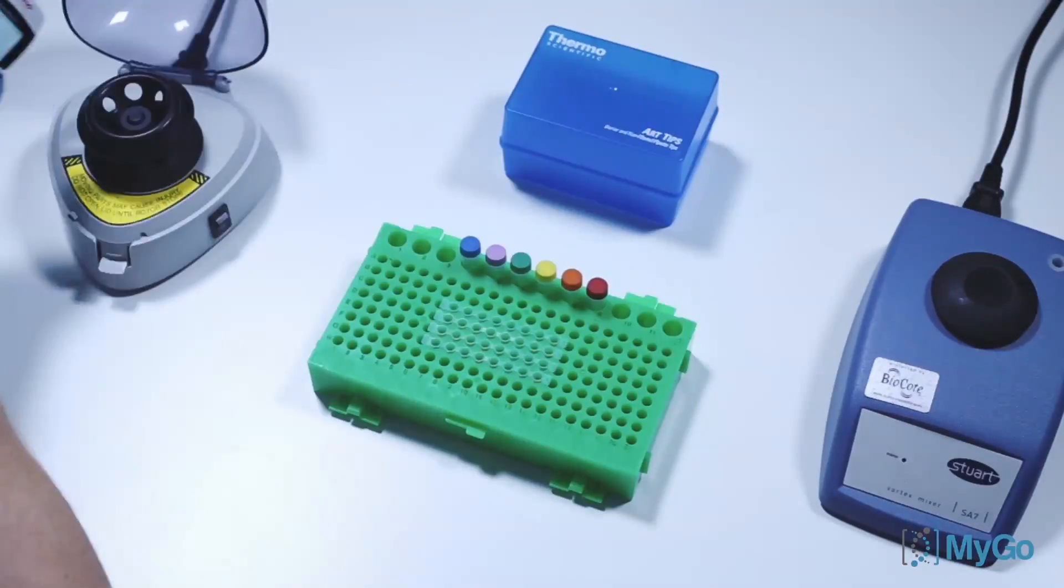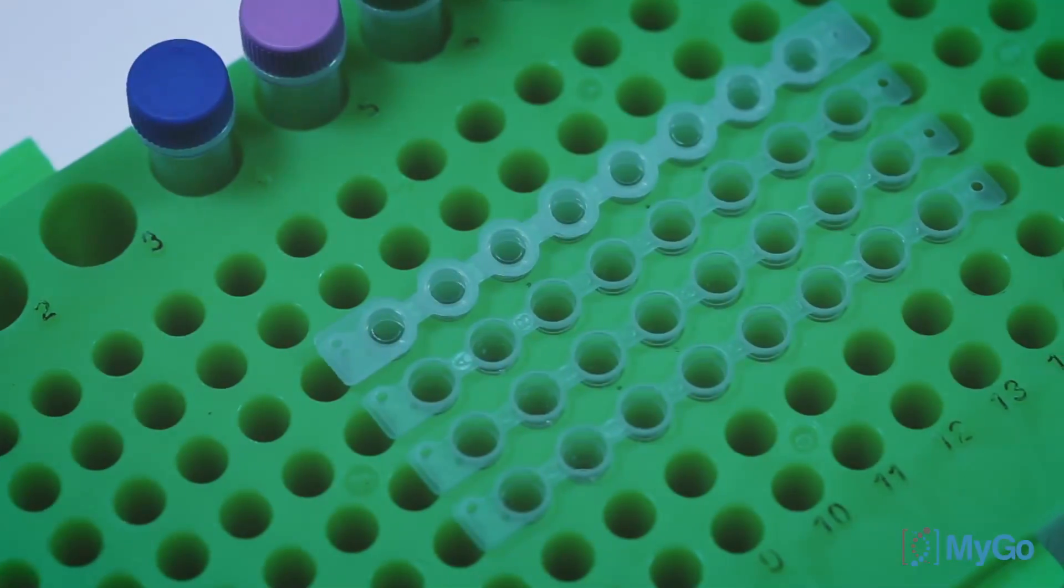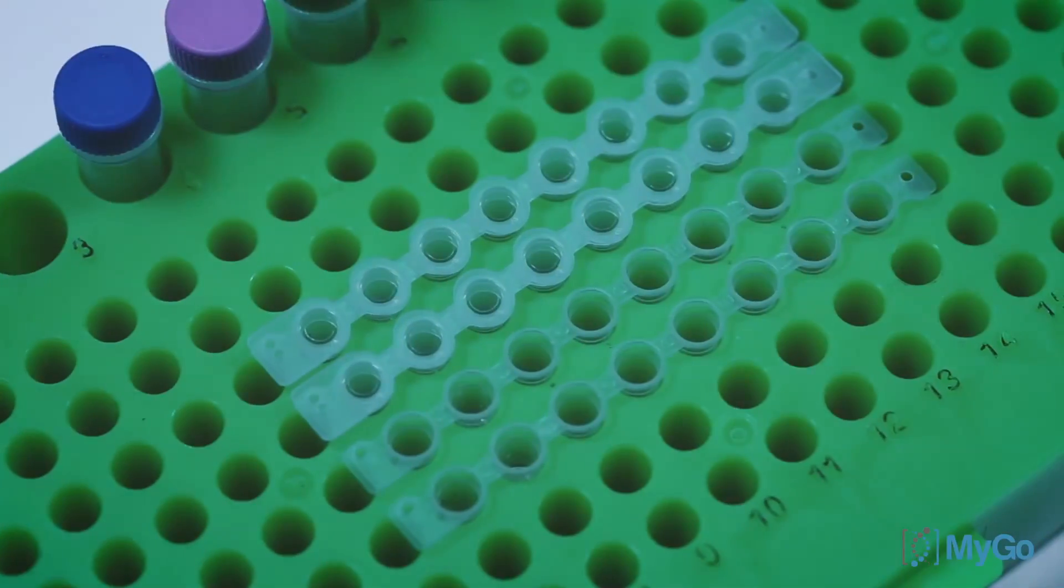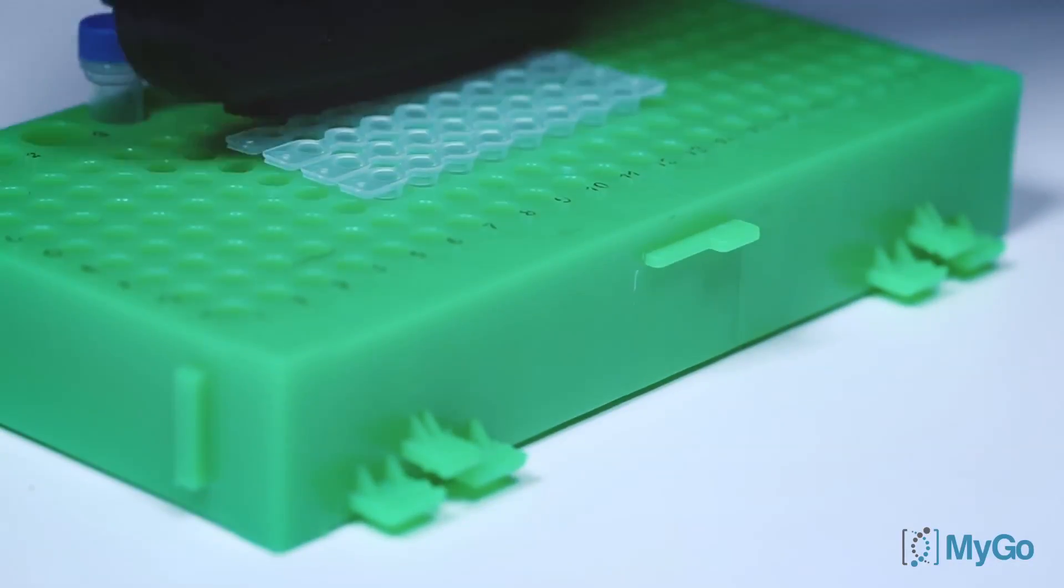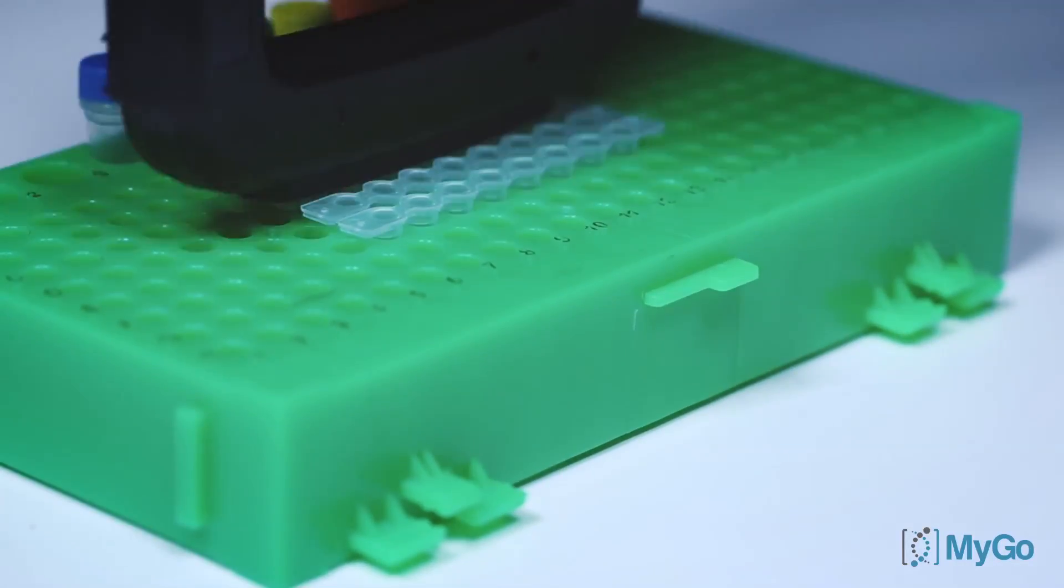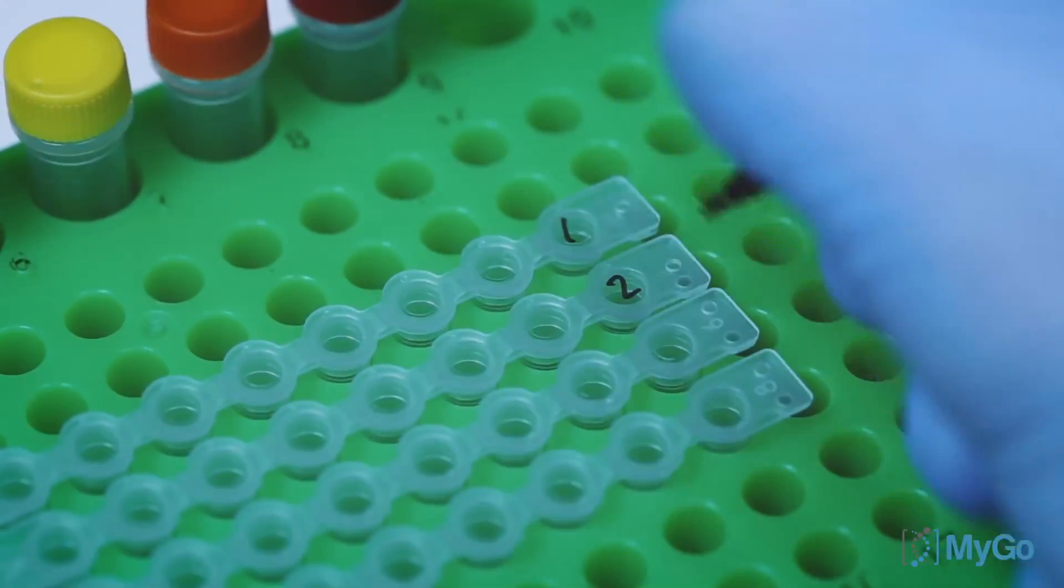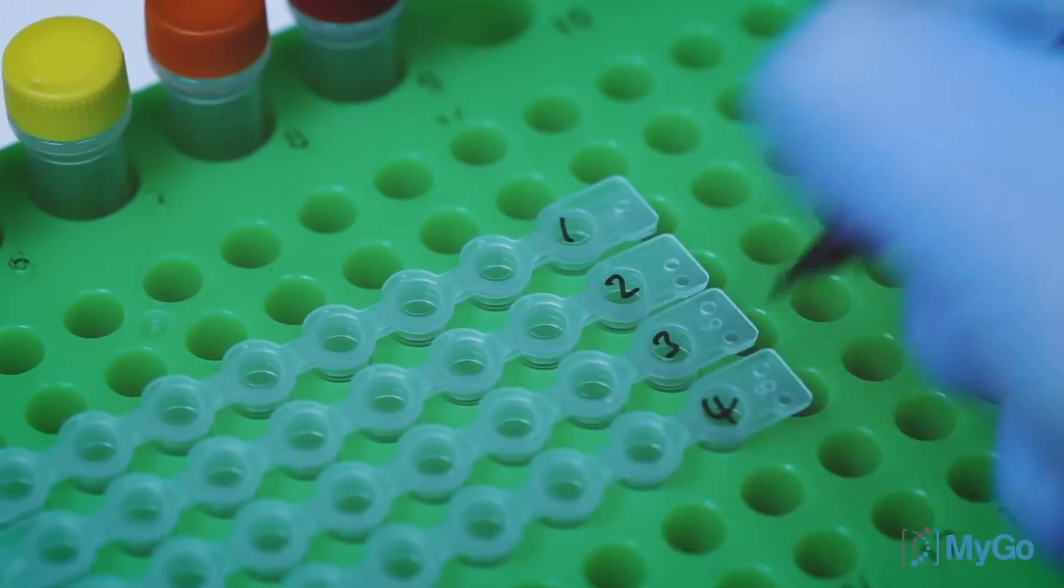Seal the tubes with the MYGO 8-well strip caps, and if available add extra force. Make sure that each strip is sealed securely and take care when sealing the tubes not to damage the rims of the caps. Strips can be labeled on the top but must not be labeled from the side.